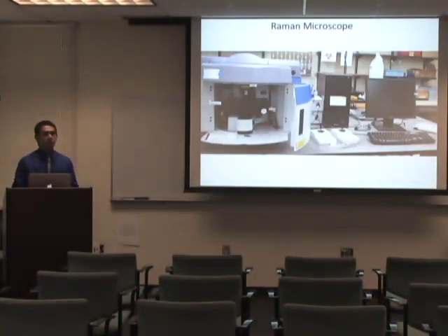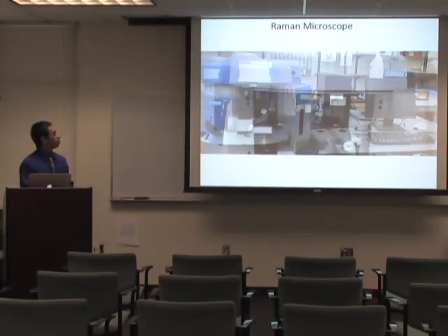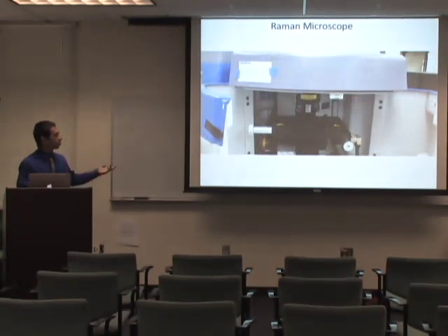So, the Raman Microscope. This is what Valentina and I actually use in our work. As you can see here, this giant box right here. I'll zoom in a bit. It's actually more like a compound microscope. On the side right there is a computer where we collect all of our data. And when we zoom in, we can see it's just a regular compound microscope, except on the objectives, there's a laser that will hit the molecules and create the information that we need.